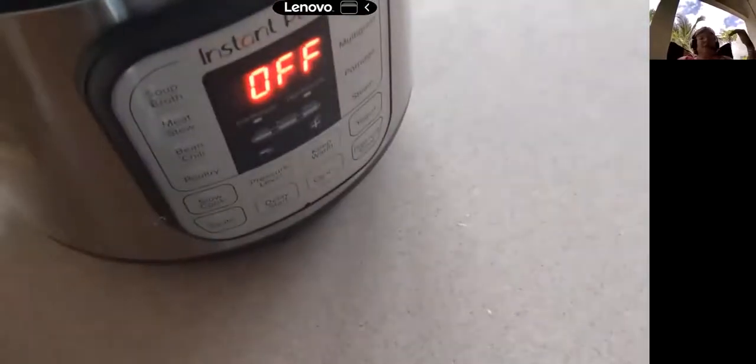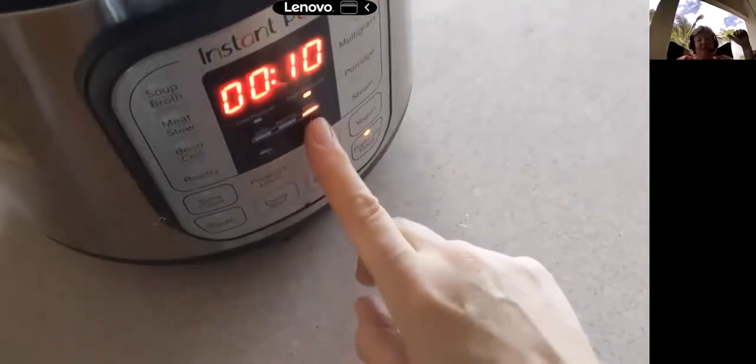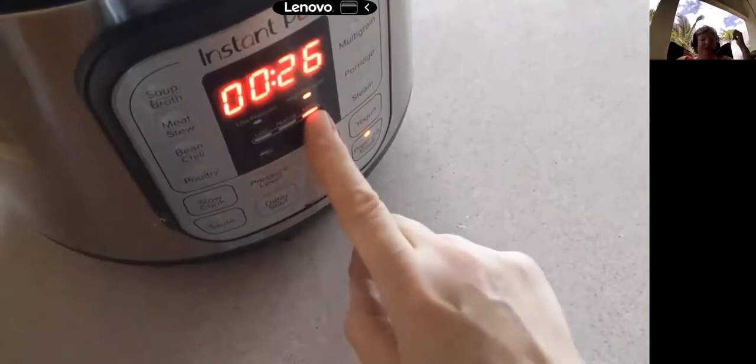And once everything's in, close your lid, turn it on. If you have a canning pressure cooker, you can use that because a canning pressure cooker will go to 15 pounds. And you can see here that I'm not doing 15 minutes. I think I set it for 30. And that's it. We're done. Everything's ready to go.